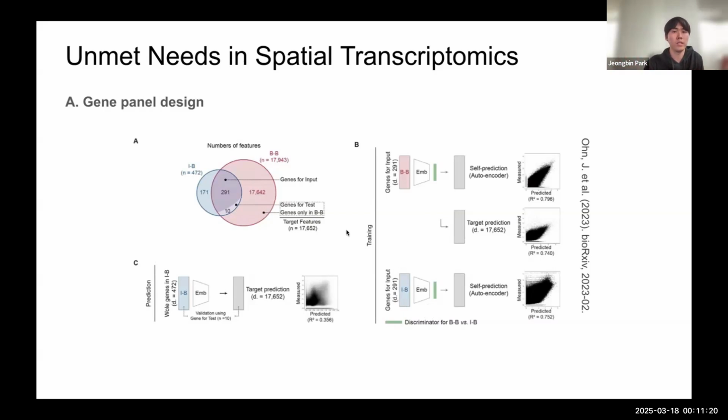In such a sense, even the image-based spatial transcriptomic gene expression pattern, which has a different statistical distribution from the barcode-based one, can guide us to infer the other gene expression data. So by introducing that type of approach, we can eventually predict from the intersected gene expression pattern to total gene coverage. It's possible, but I think it's still ongoing. For example, there is a lot of biological variability and there are platform differences.